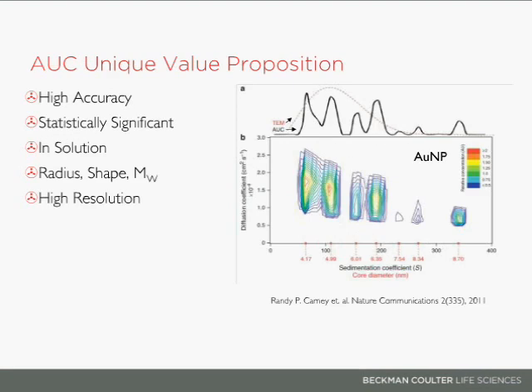If you're working with particles in solution, you want to study them in solution. You want to see how their properties are in solution instead of putting them down on a substrate and analyzing them.